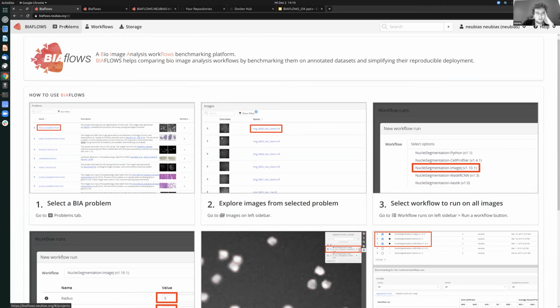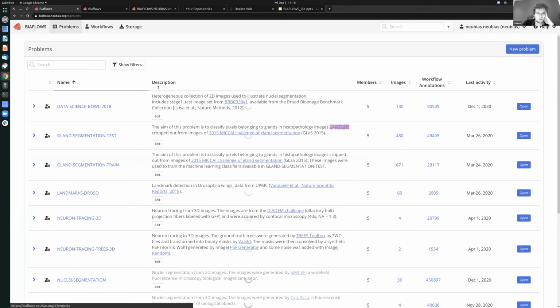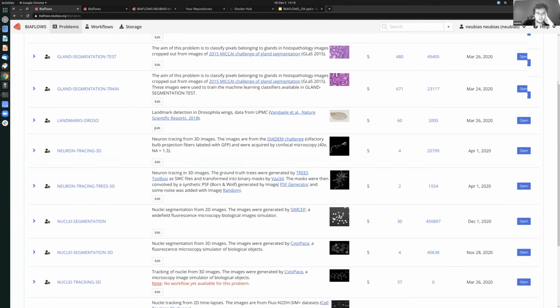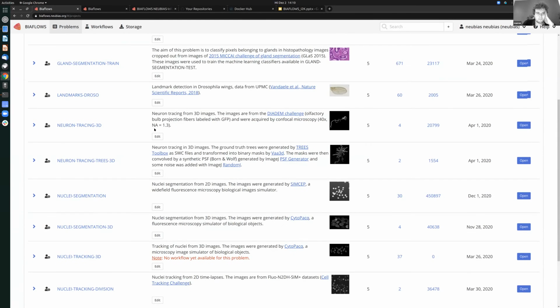You have the main menu with the problems tab here. So you click on it. What you see here is the list of the available problems. We have more than 10 of these.